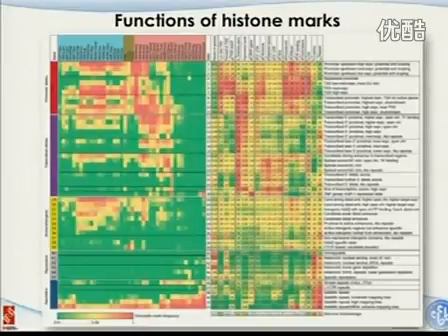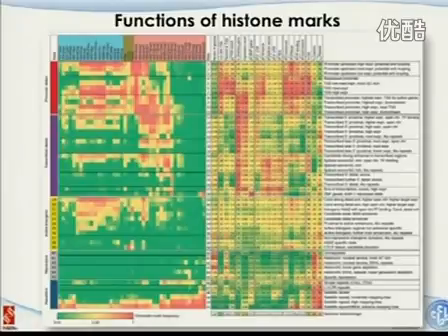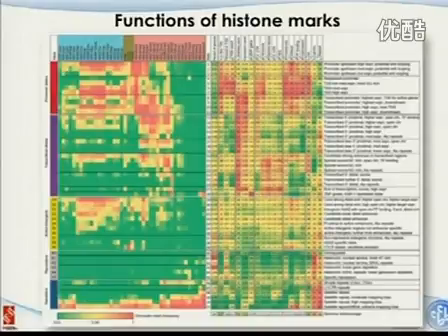Once we got those histone markers and ChIP-seq data, we can use the previous approach to identify the enriched regions, that's one thing. And the second one is, if more and more others show up, different histone markers, most of them we really don't understand the biological functions of. And this is one effort, trying to use computational tools based on our existing knowledge to understand what the functions of histone markers are.